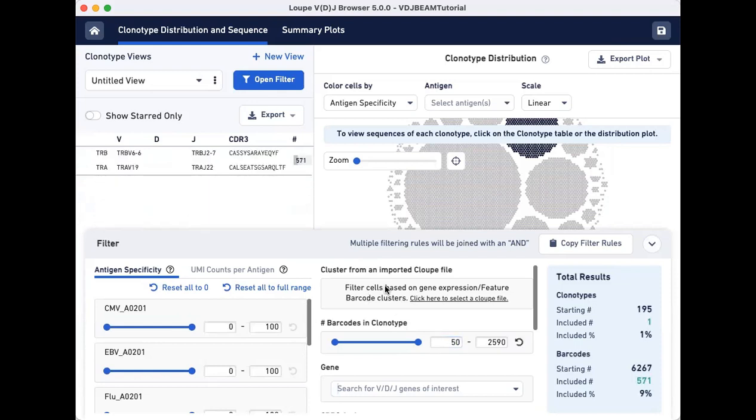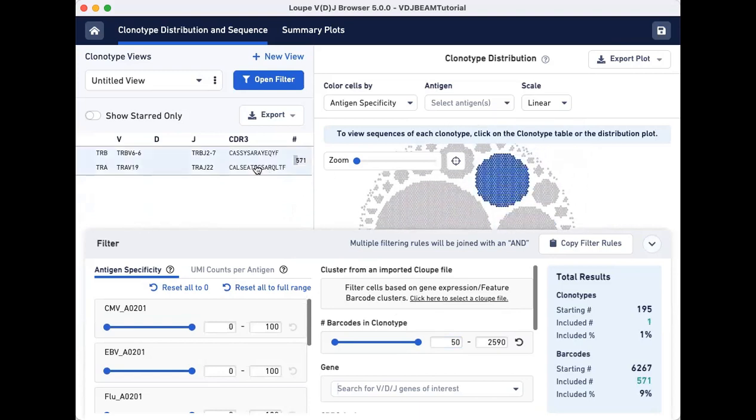With these filtration criteria, we now have one remaining clonotype that associates with the SARS-CoV-2 antigen.